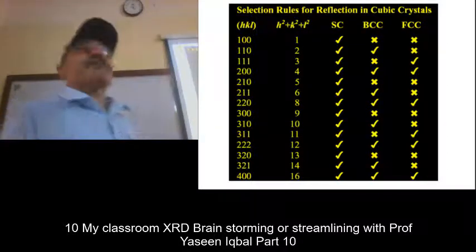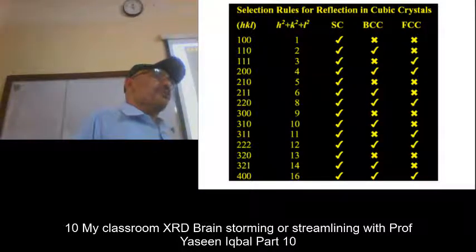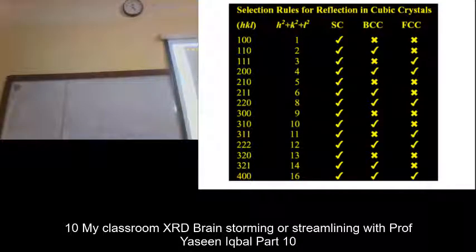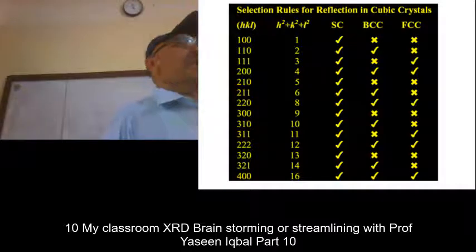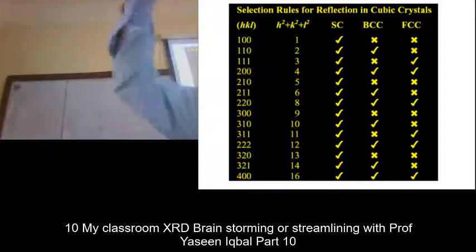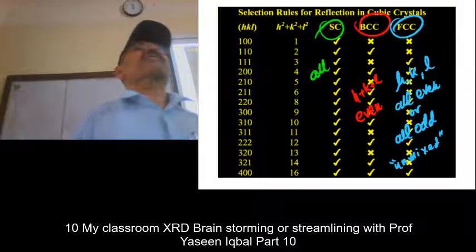2 theta angles. They used to scatter the X-ray beam from the sample, and there used to be a manual plotter type thing, and that used to plot the intensity of peaks. There used to be tractor type printers.